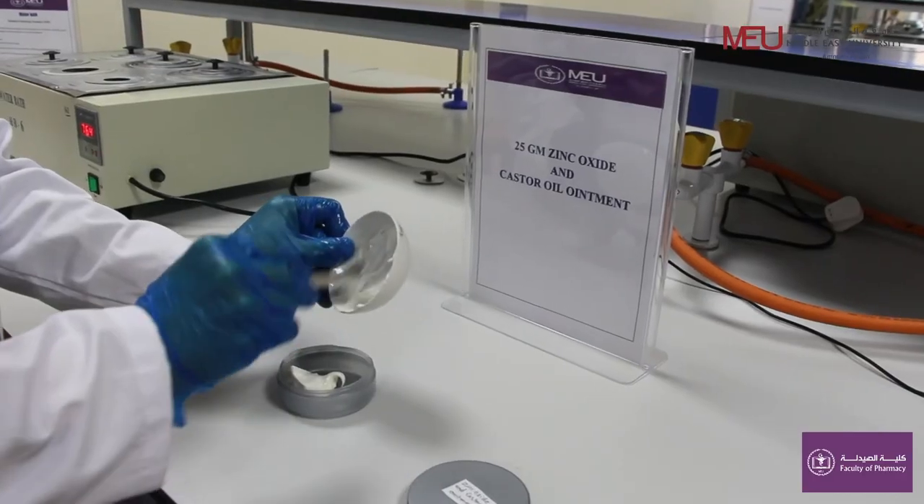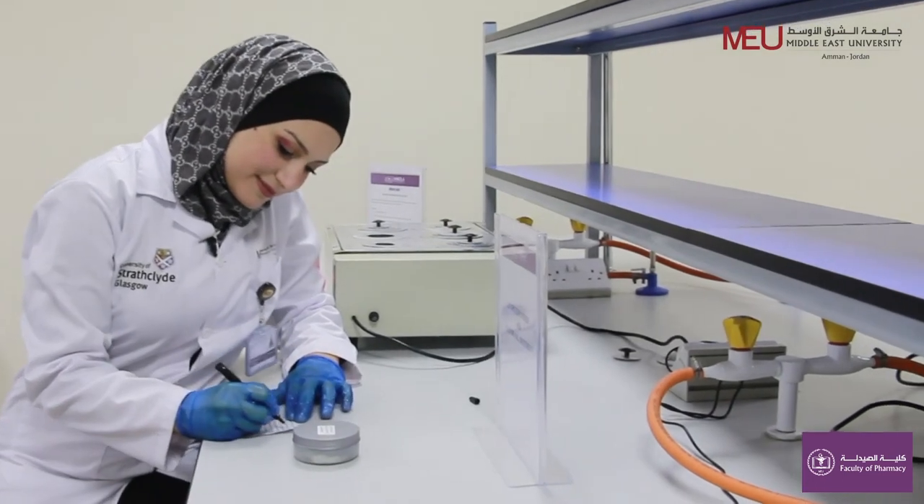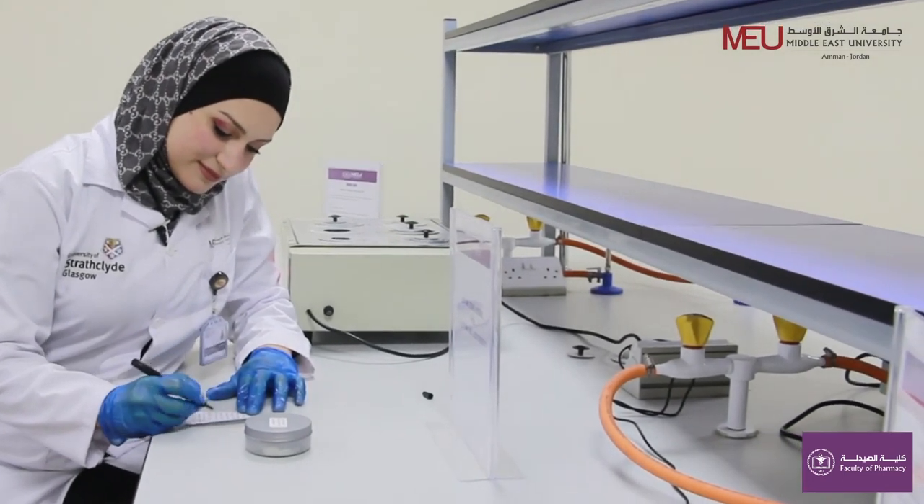Transfer the prepared ointment into a jar. Label it with proper labeling. Thank you.